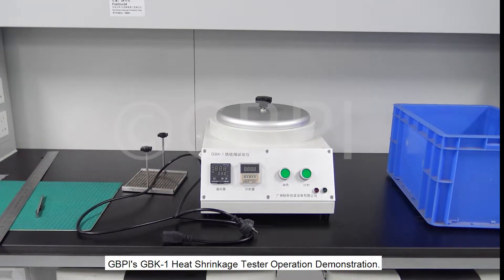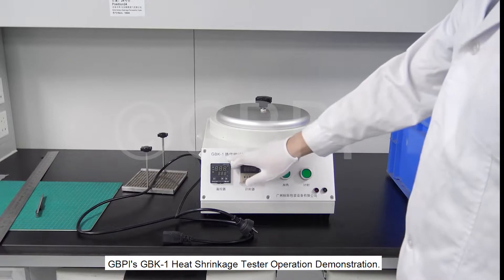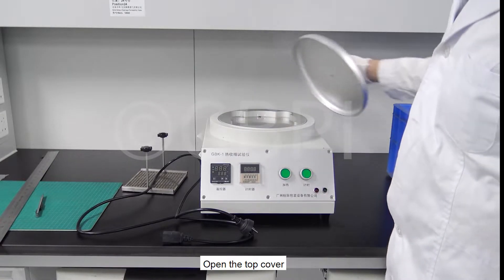GBPIs, GBK. Heat Shrinkage Tester Operation Demonstration. Open the top cover.